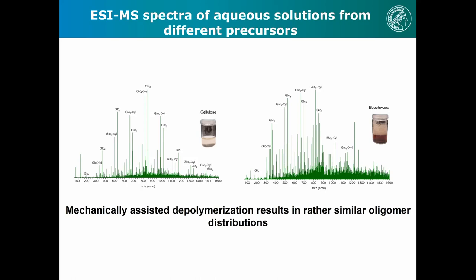Here I actually did something which you sometimes find in very old textbooks or lab classes, a tasting test. Normally it's not recommended anymore nowadays for qualitative analysis, for good reasons. So we actually did the tasting test. We heated it so that all the anhydrides would also go down, neutralized because the solution is still acidic. And then I really stuck my finger in it and licked it. It tastes like sugar. Of course, we also know that from the mass spectrometry, but I wanted a central exercise.